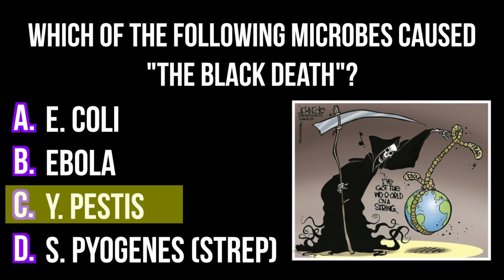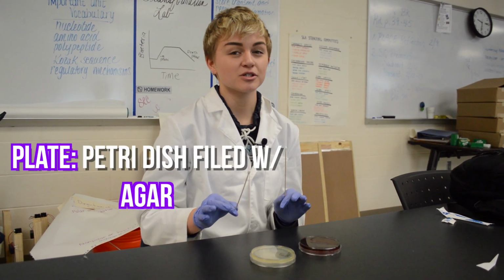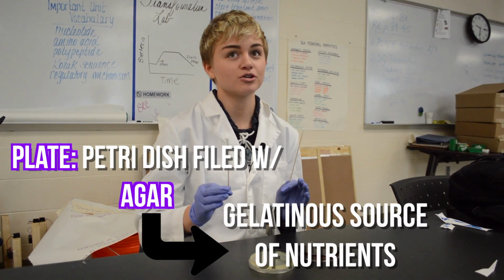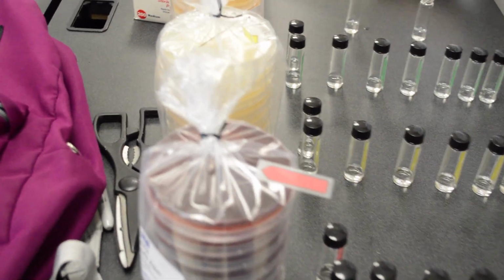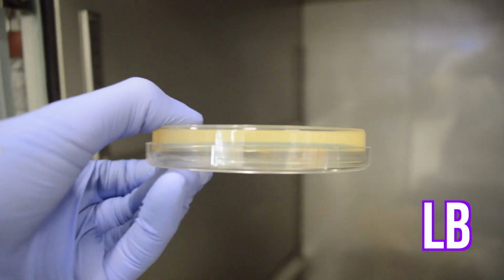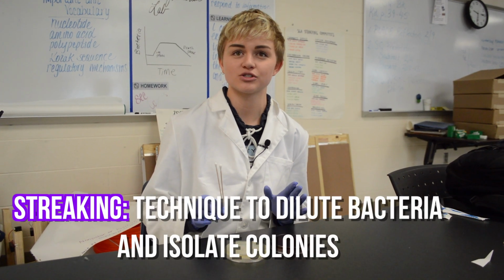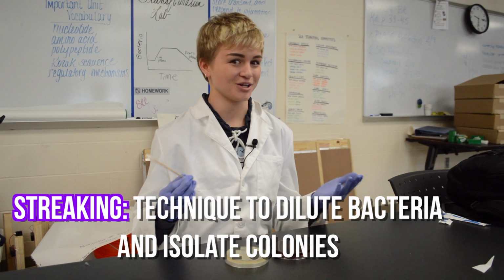After we've collected all our swabs, it's time to plate. Each plate, which is what we call a petri dish after it has been filled, contains agar, or nutrients which act as a type of food for the microbes. We're going to plate our samples on 3 different types of agar: eosin methylene blue, tryptic soy, and luria broth. In order to get our microbes on the plate, we are going to use a technique called streaking to isolate a pure strain from a single species of microorganism and get colonies.